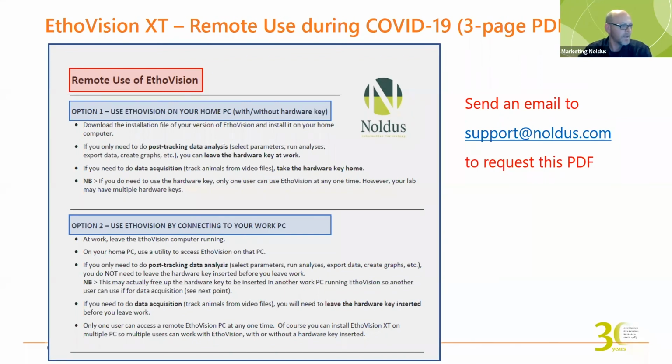Follow up on the update question. Do you not recommend updating in the middle of a large cohort experiment? What could be impacted?